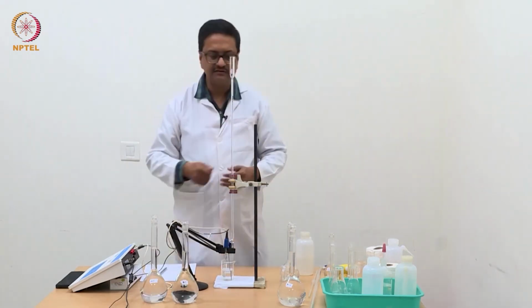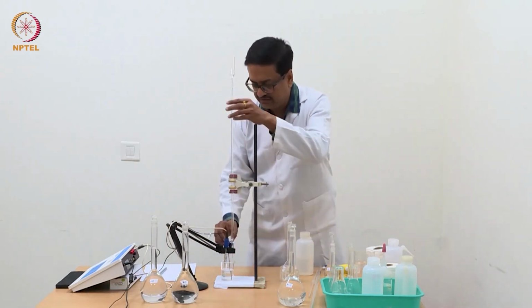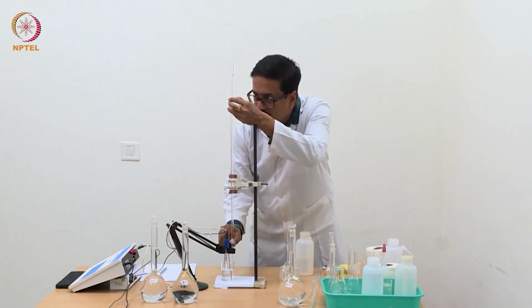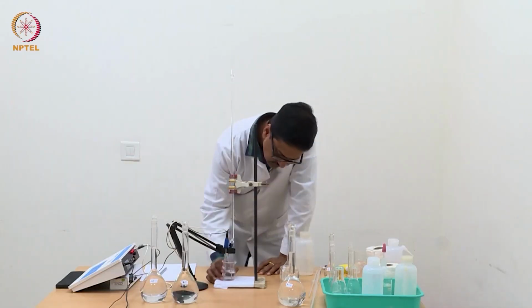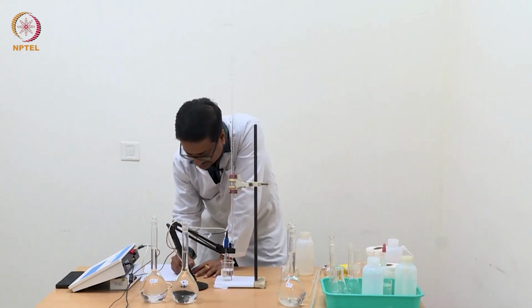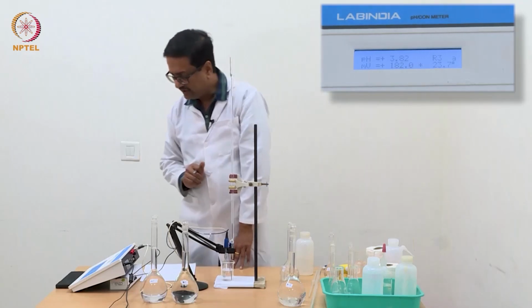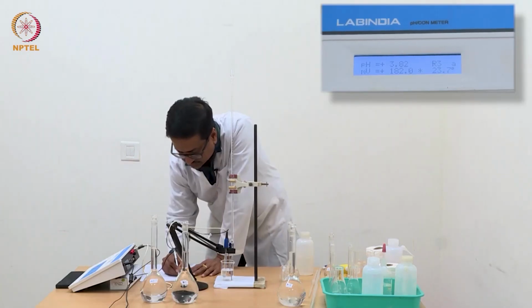So what we see is the pH is increasing, but it is increasing very slowly, which is always expected, and we add some more drops of NaOH. So we have added another 0.02 ml. After addition of 0.06 ml of NaOH, the pH almost does not change, it stays at 3.82.